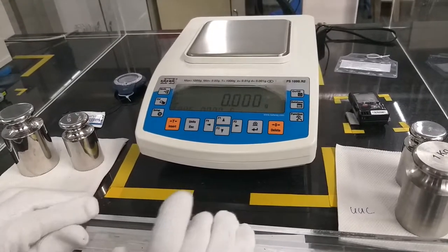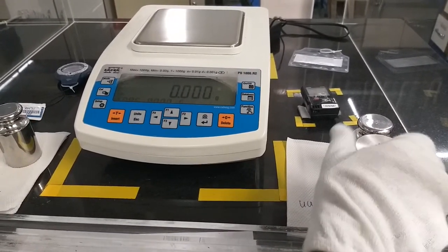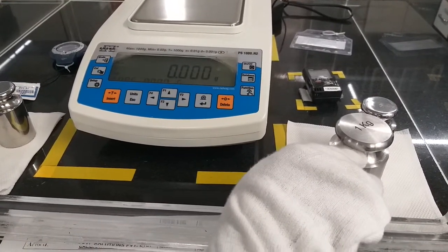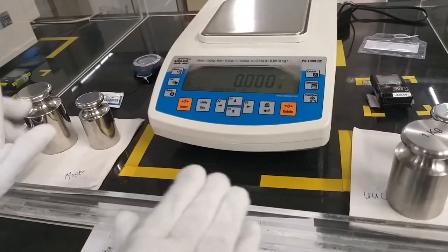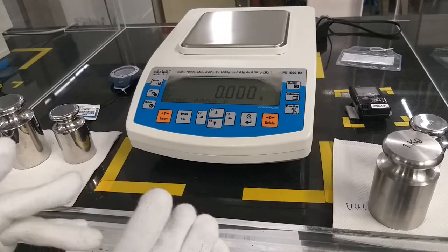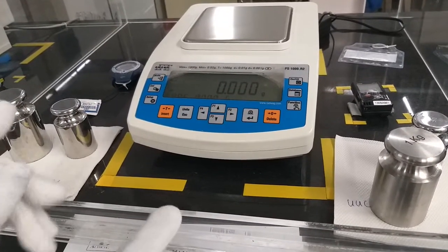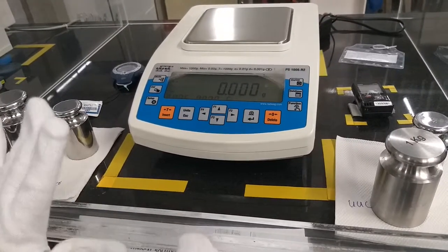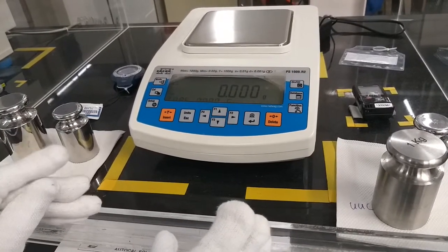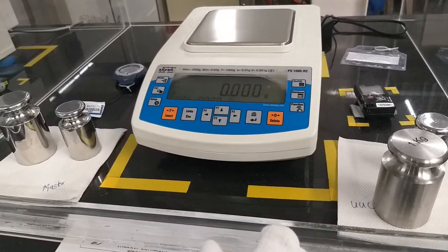Before starting calibration, we clean the UUC — unit under calibration, that is the weight of the customer. We clean it with acetone and keep it for soaking with our masters for approximately 30 minutes to match our lab temperature. The temperature in our lab should be maintained at 23 plus or minus 1 degree Celsius. The relative humidity should be between 40 to 60 percent RH, and the air pressure should be 990 to 1010 hPa.